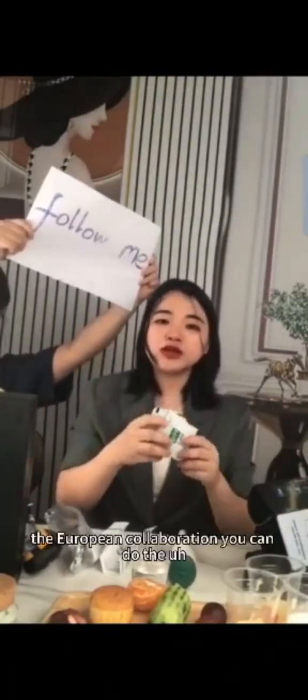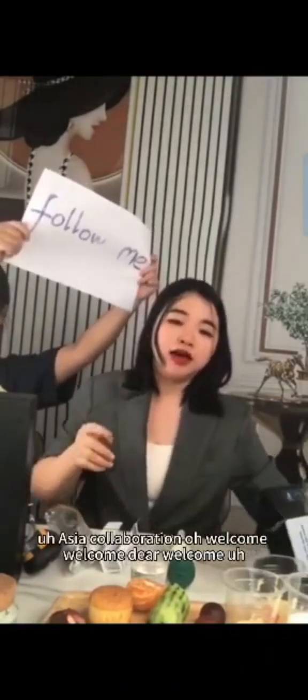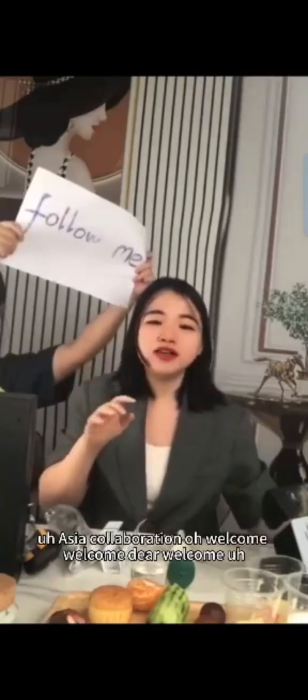You can do the European calibration. You can do the Asia calibration.